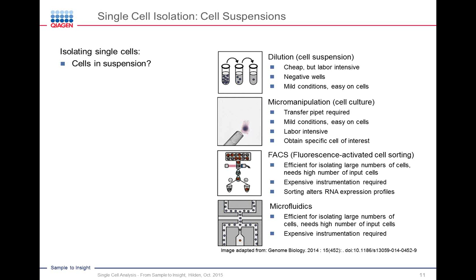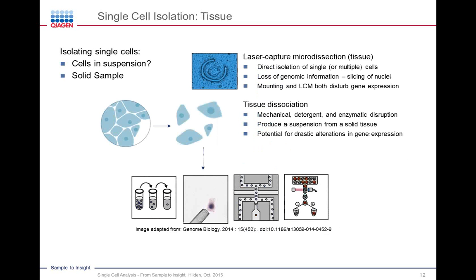So these are all fine and good if you're dealing with cells in suspension, but this is not always the case. In fact, quite a lot of the time you're dealing with solid tissues. Your options here are more limited.